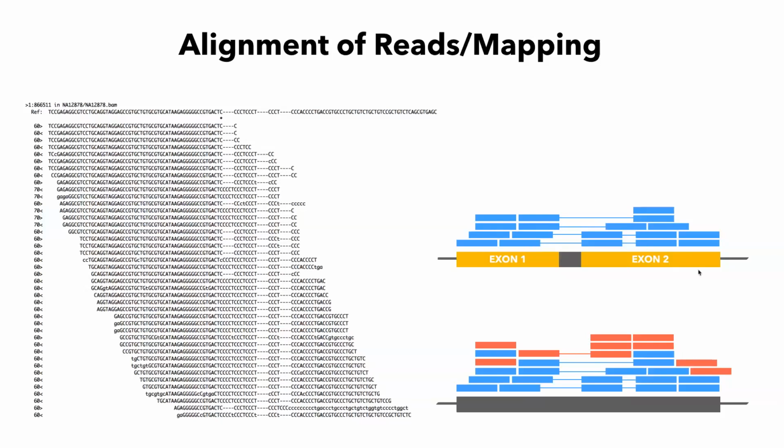As a result, one of the challenges will be quantification. Because what do we need to quantify? We need to quantify full sequences of genes from here to here. So given different alignment of reads to the different regions, we will actually be getting different results. And so one of the challenges is going to be quantification.